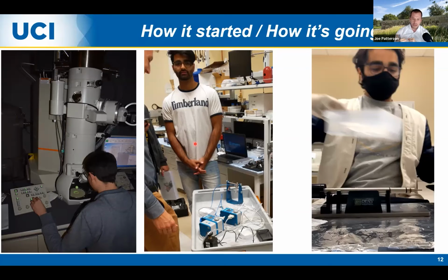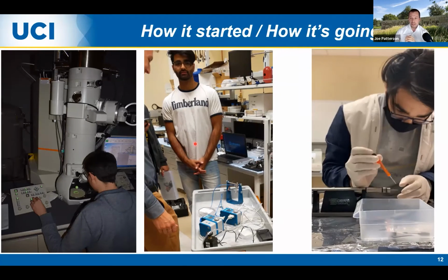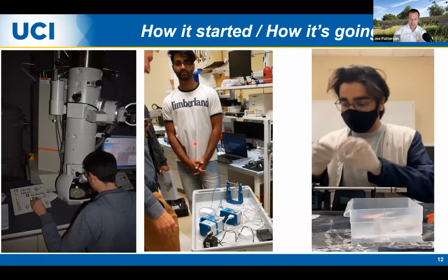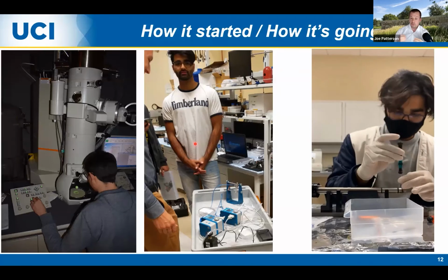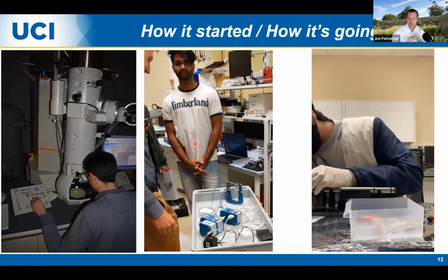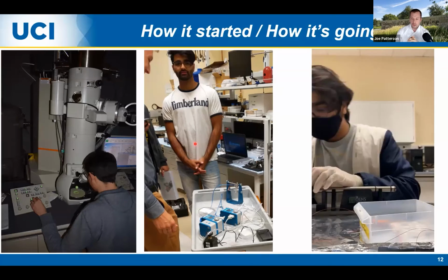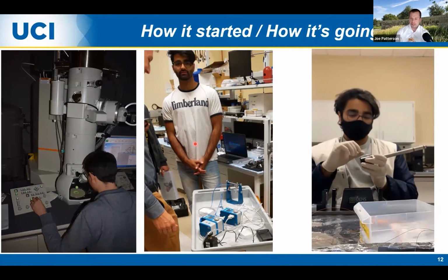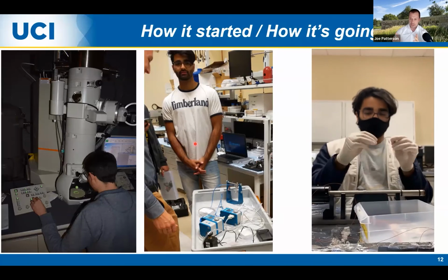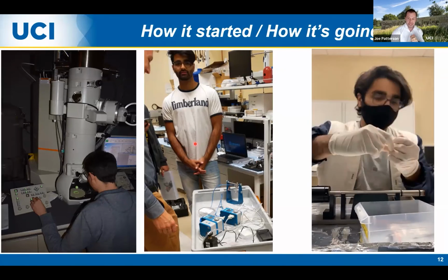But if we work hard at things, if we come in every day and put the hours in and study, we can really learn anything we want. And here again is another time-lapse video of Arne disassembling and cleaning and then reassembling this holder, which is something he has to do as part of his research on a regular basis. And you can see now that he's really mastered these skills. He's sitting back and relaxed and very confident with everything that he's doing.